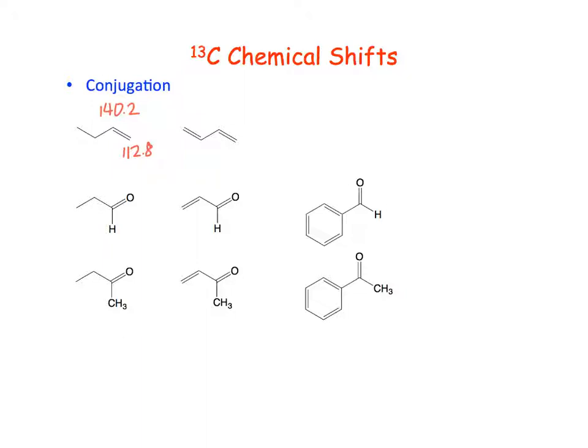If we add another double bond and cause some conjugation here, then this goes slightly upfield, 137.2, and this is a little bit downfield, 116.2.